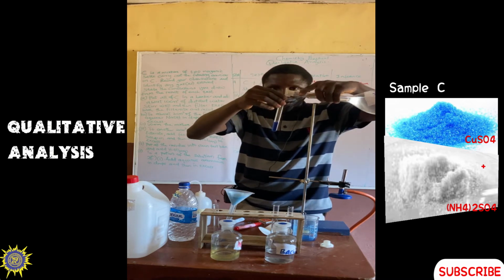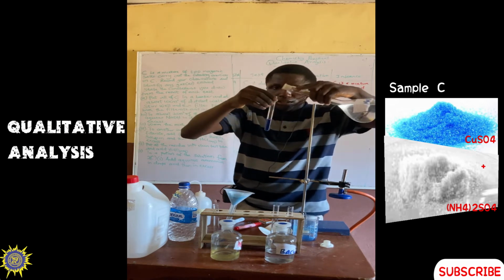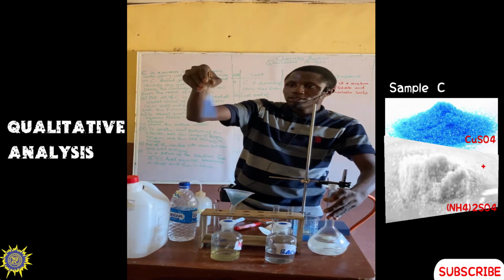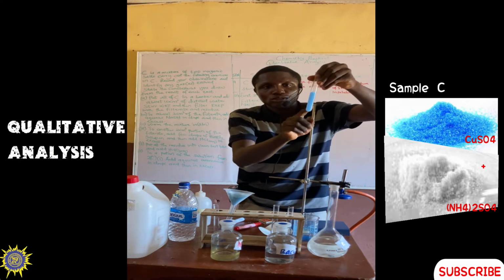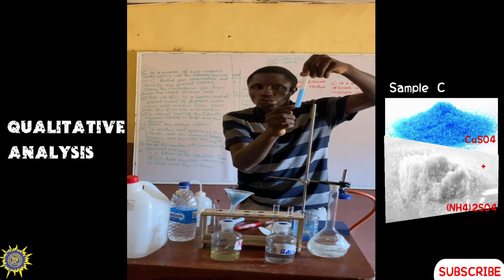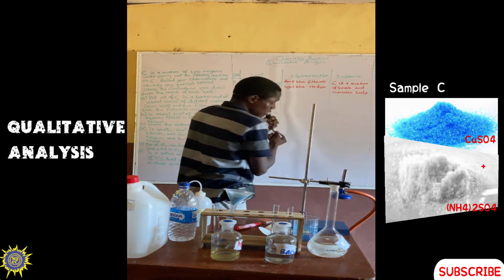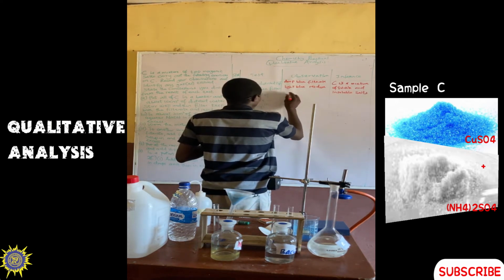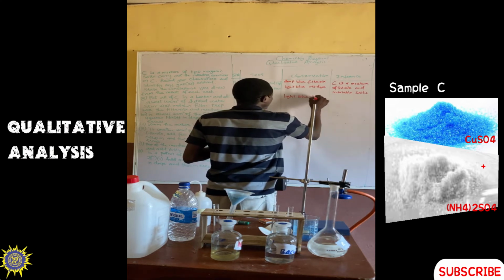Let's add it. You can see that when you add it in drops, it turns to a light blue precipitate.